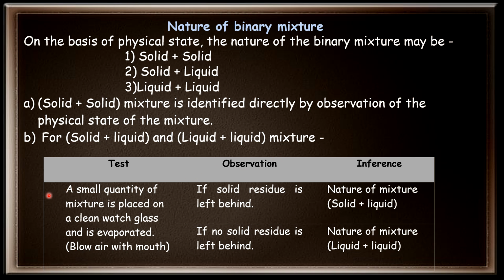A small quantity of mixture is placed on a clean watch glass and it is evaporated. Sometimes it is blown with the mouth. If solid residue is left behind in the watch glass, then the nature of the mixture is solid plus liquid. And if no solid residue is left behind, or only liquid is left behind, then the nature of the mixture is liquid plus liquid.